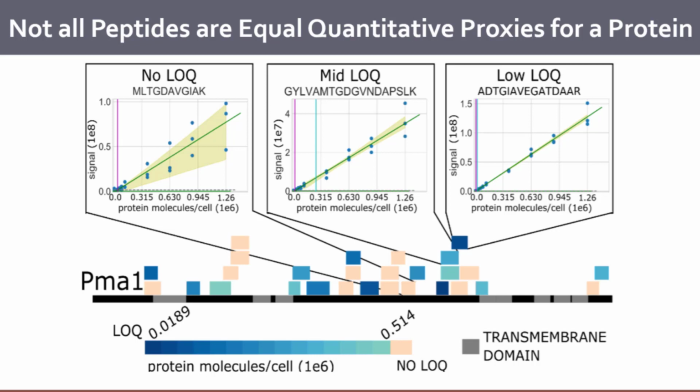Yeah? So what about just reporting the distribution in terms of the accuracy of quantitation? I like very much the distinction that you make between something simply being detected and something being quantified. But in reality, we always have some error bar that sometimes you can estimate quite accurately, other times less so. But what about just having a continuous distribution that reflects the error estimate?